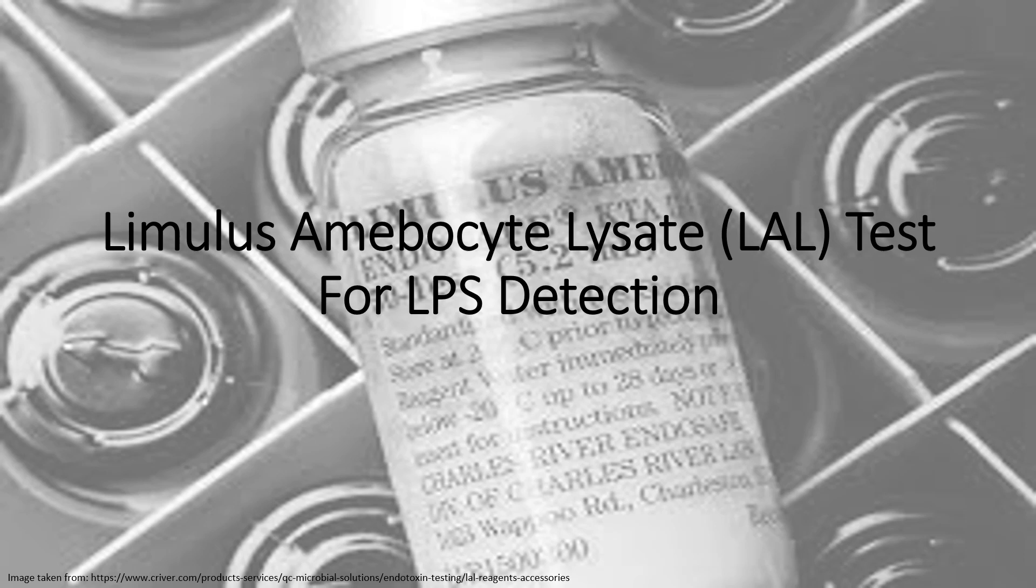Hi everyone, here is an experimental video of the Limulus Amebocyte Lysate LAL test that we performed and would like to share with you.